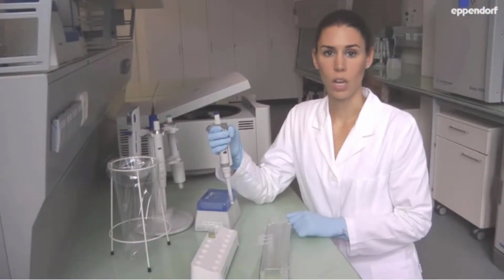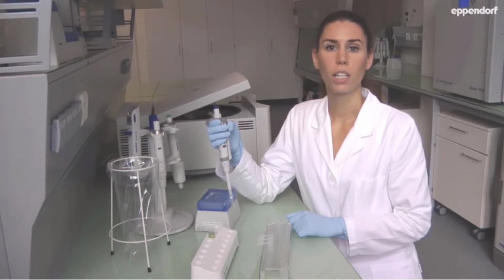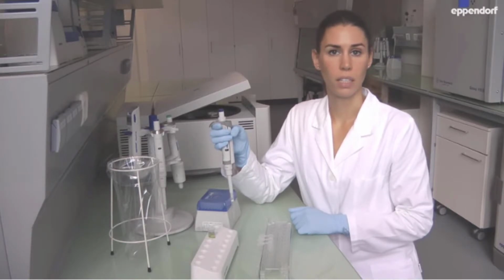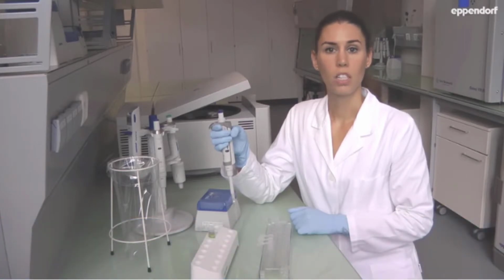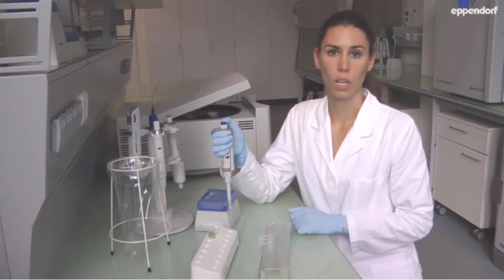When aspirating liquid, 2 factors influence accurate liquid uptake: the aspiration angle and the immersion depth. The aspiration angle should be vertical. Otherwise, too much liquid is aspirated. The immersion depth, meaning the depth of the pipette tip inside the liquid, should be as large as necessary but as small as possible. If the tip is immersed too deeply, additional liquid can be easily aspirated due to the capillary effect. Press the control button down to the first stop and immerse the tip into the liquid.